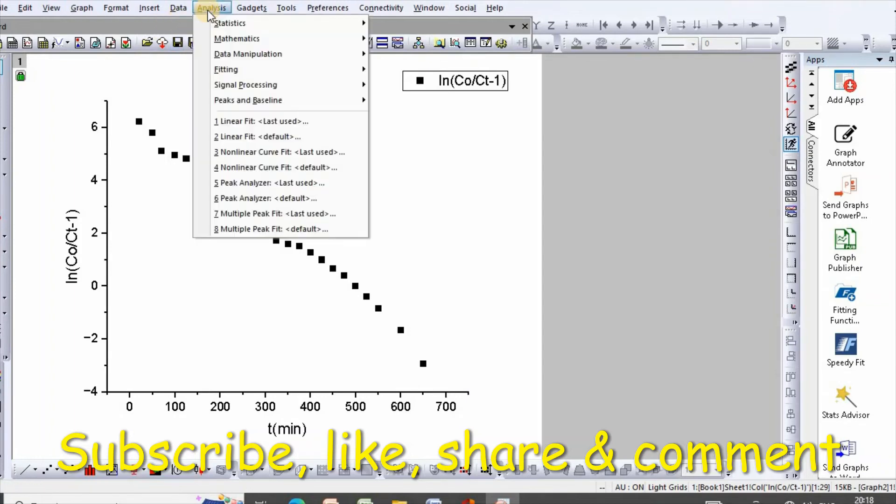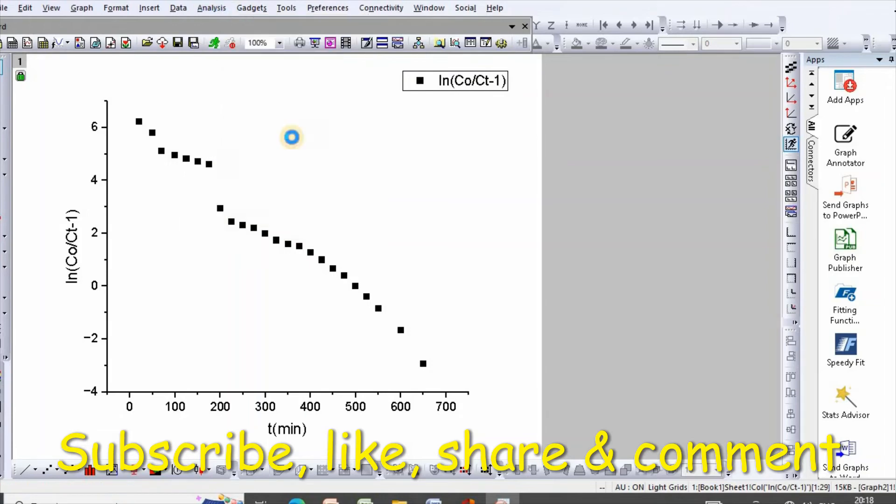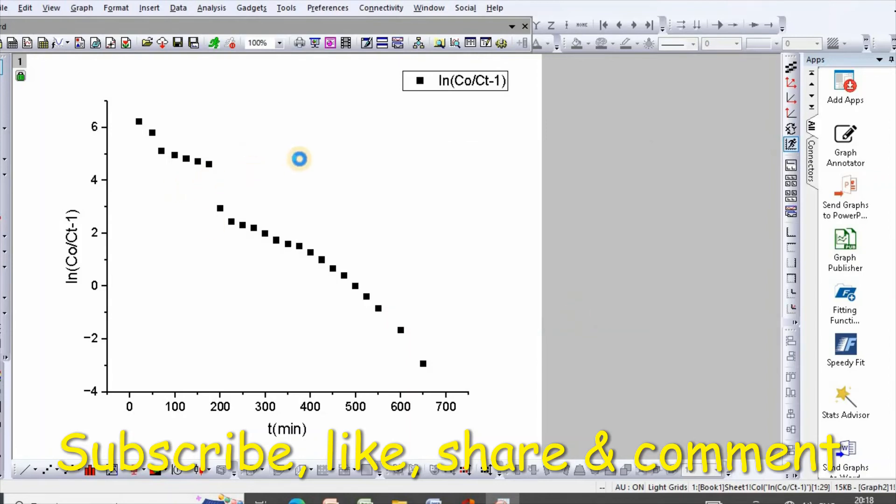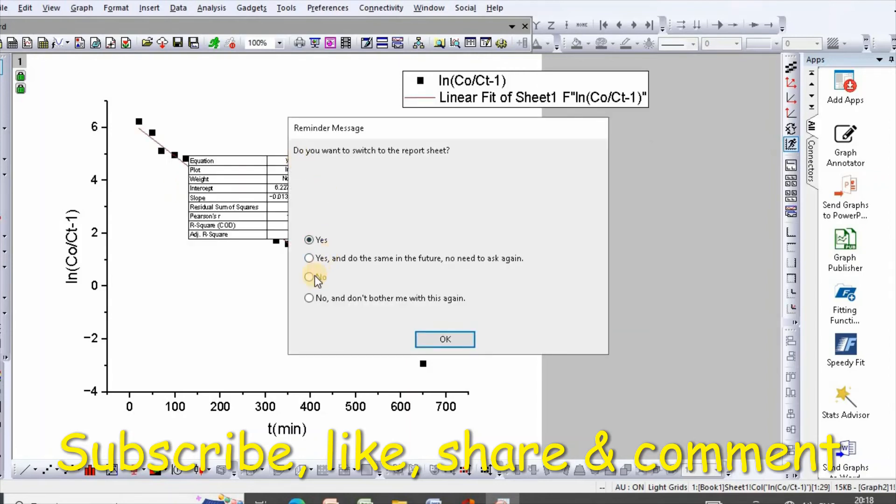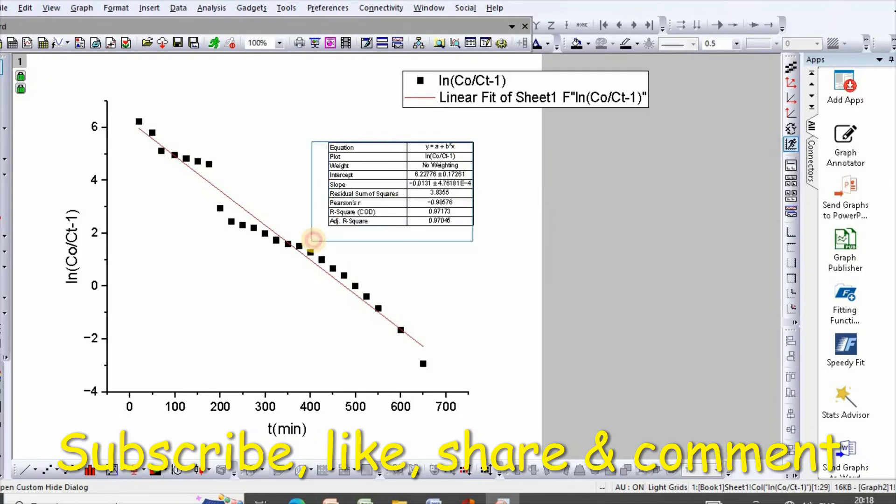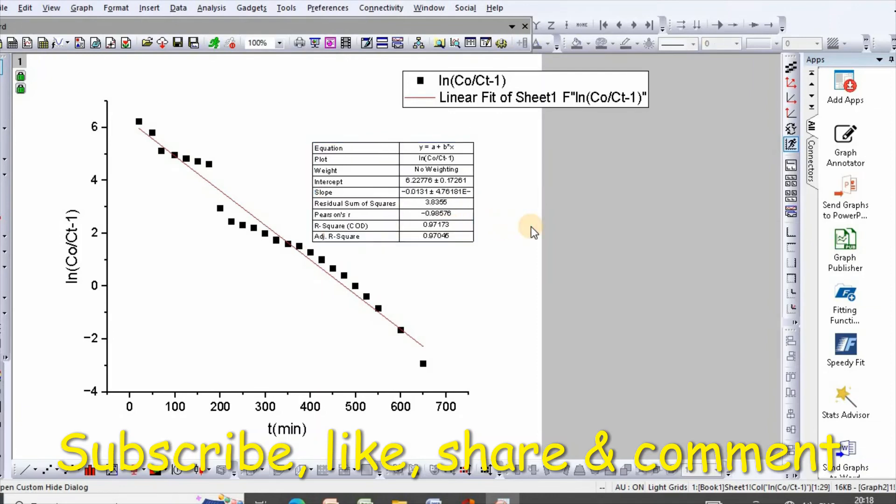Then go to analysis, then linear fit default, then click OK and no, then OK. Here is your plot.